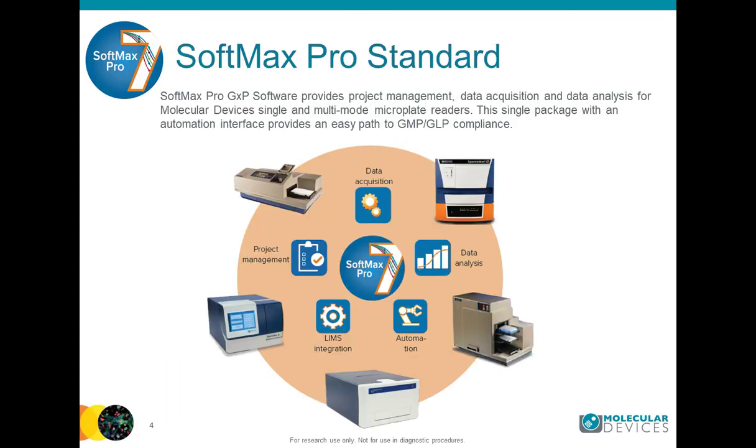So let's get started right away with a brief introduction about what SoftMax Pro is. SoftMax Pro is Molecular Devices' multi-mode reader control software. And SoftMax Pro really does three things. It's a project management tool, so you can use our software to manage your complete project, every single experiment.